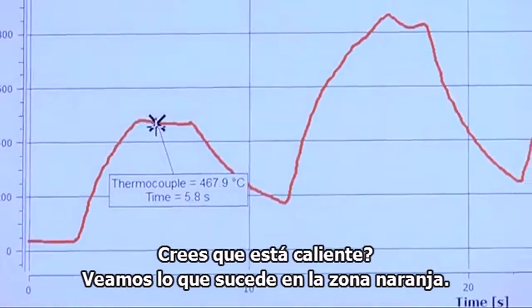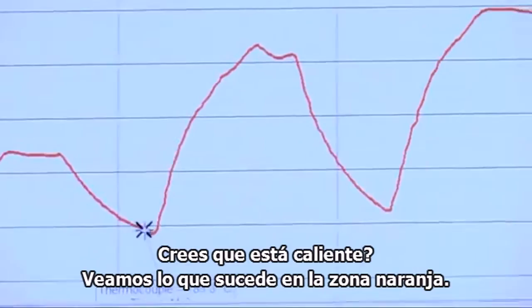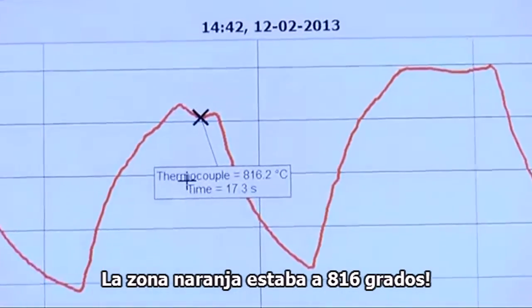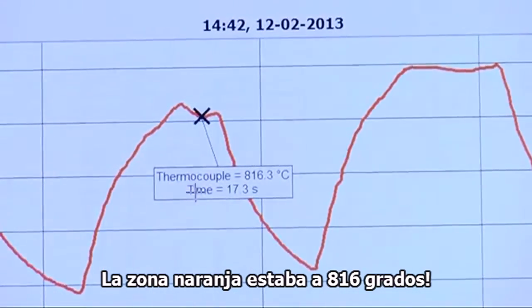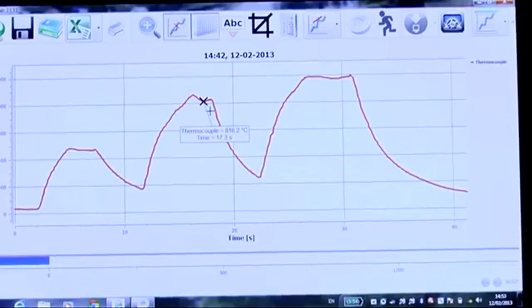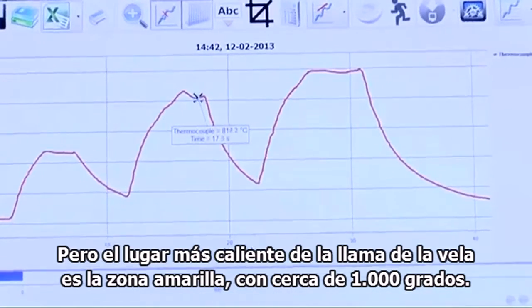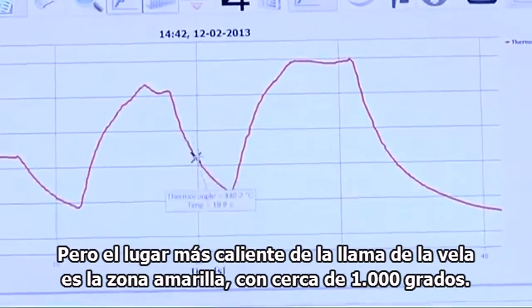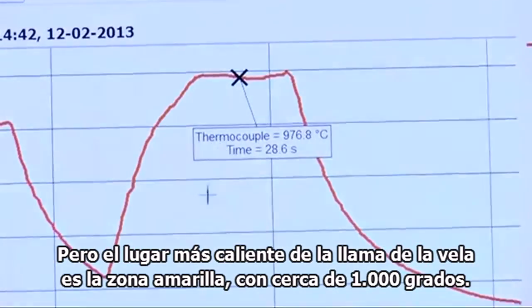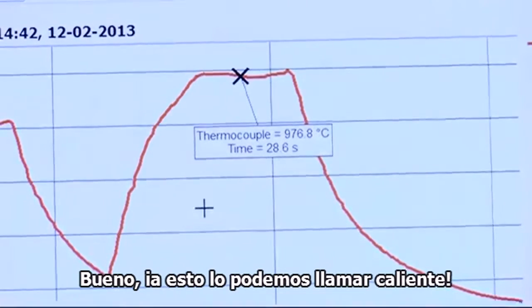Do you think that's hot? Let's move to the orange zone. In the orange zone, we reach almost 820 degrees centigrade. But the hottest place of the candle flame is the yellow zone, with nearly 1000 degrees centigrade. This is hot.